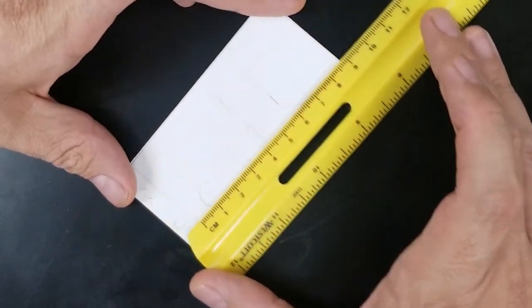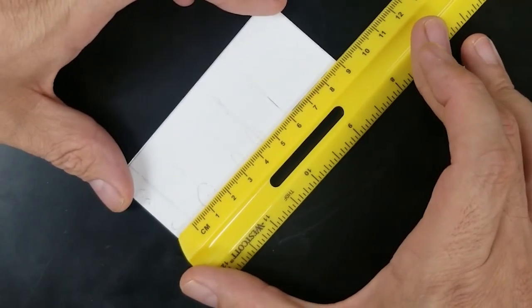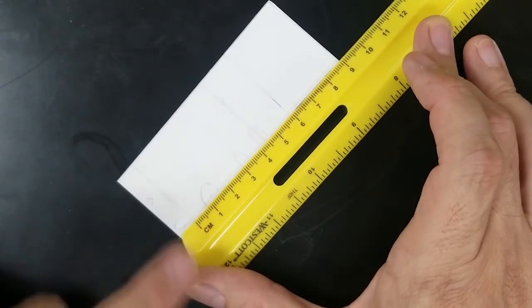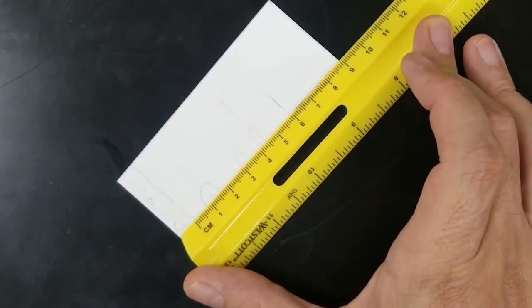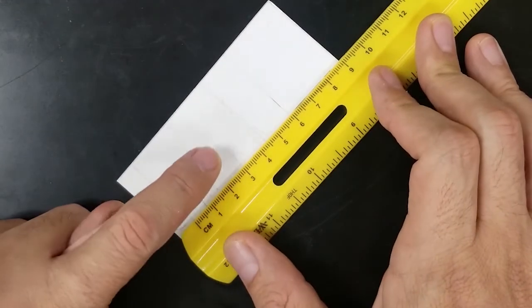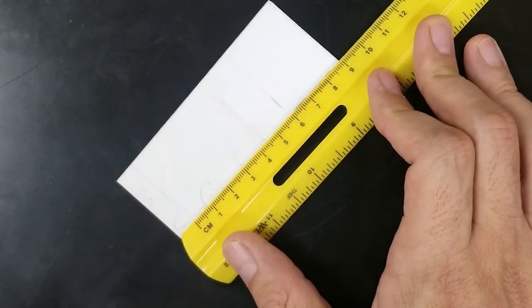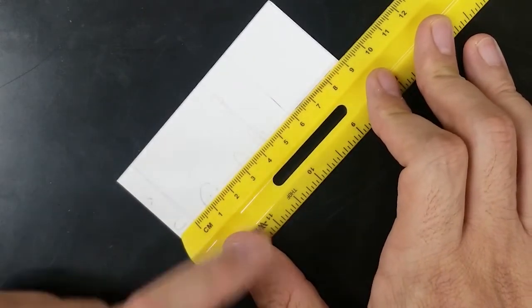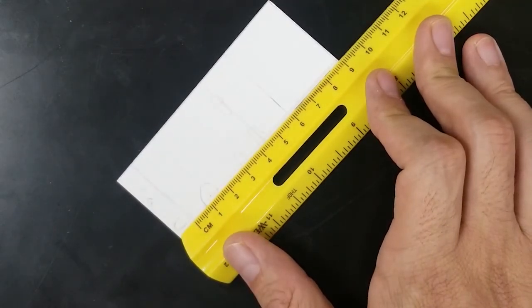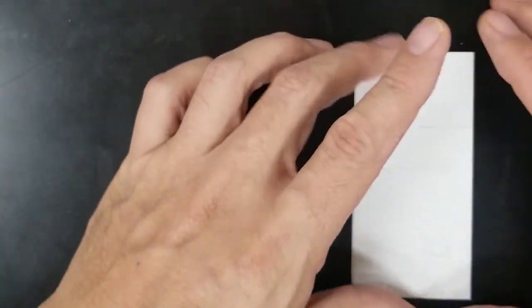Okay. The unknown sample has 3 spots. Your solvent front is the same. So the first spot here appears to be at about 1.3 or so. And then the second spot here looks to be at about 3.2, roughly 3.3. And then the last spot here looks to me to be about 4.4. So at a glance, we can kind of see what our unknowns were.